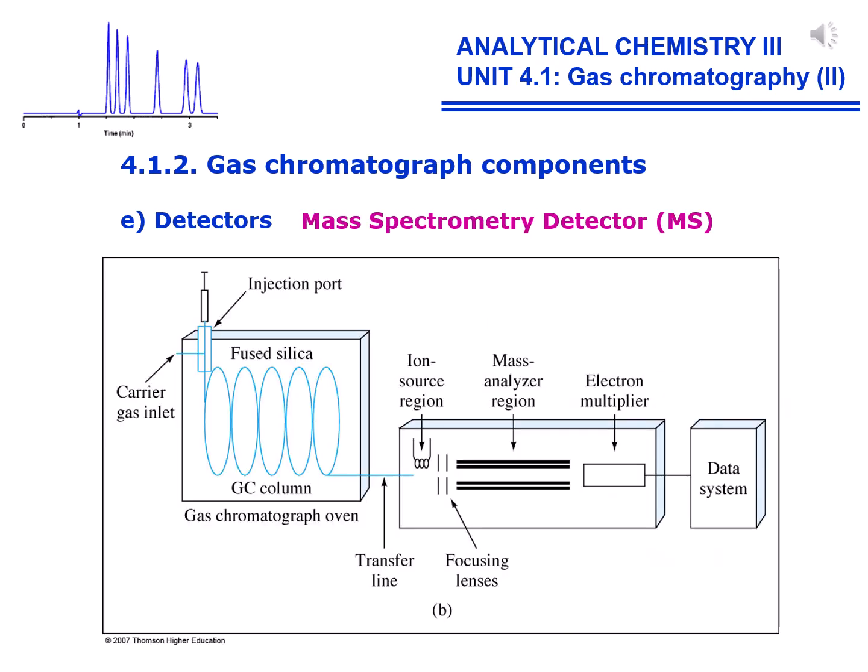Mass spectrometry detector, MSD. It's a very powerful tool currently available for the identification of the different components of a complex mixture. For this reason, it's the most widely used detector coupled to a gas chromatograph, together with FID. The figure shows the components of a mass spectrometer detector at the outlet of the gas chromatography capillary column.